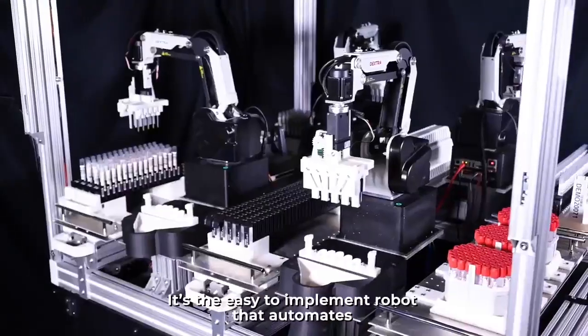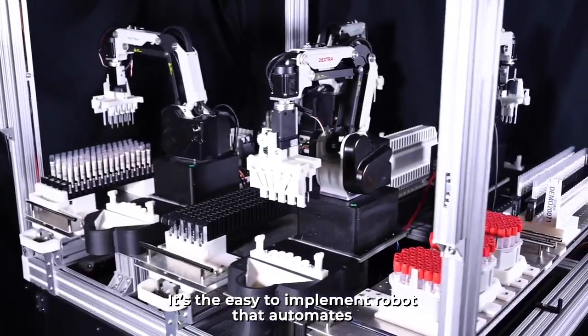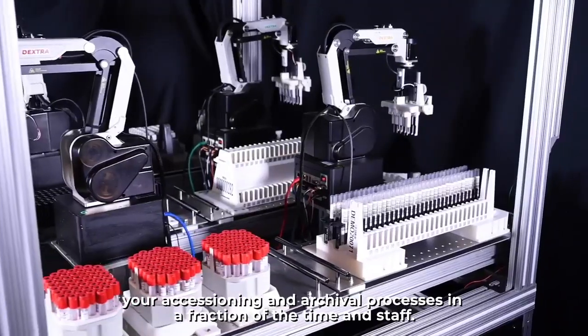This is the Eidetic Dextra. It's the easy-to-implement robot that automates your accessioning and archival processes in a fraction of the time and staff.